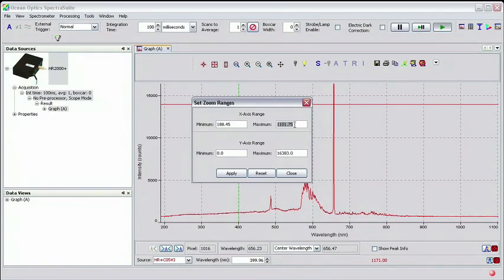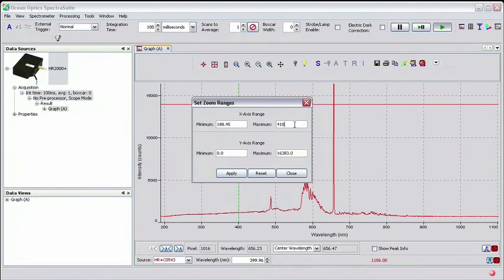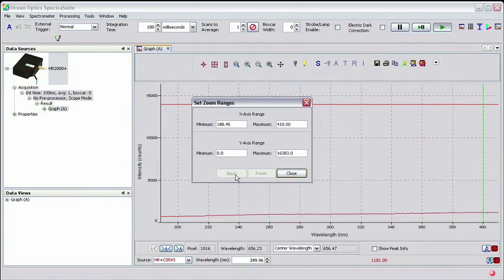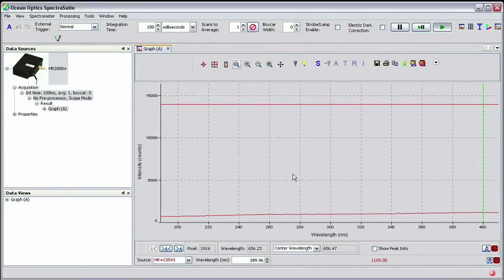Set the x-axis range maximum to 410 nm. Click apply and then close. Now, set a box car with the width of 5 in the top toolbar.